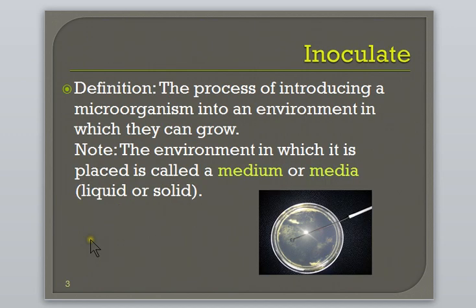The first step in cultivating microbes is to obtain a small sample, known as an inoculum, and to introduce it to a new environment which allows the microbe to grow. In the lab, we usually use a medium, such as an agar plate or a broth tube, to grow the microbe. This process is known as inoculation. In the clinical setting, a specimen such as feces, saliva, blood, or other human material may be used to obtain the inoculum.